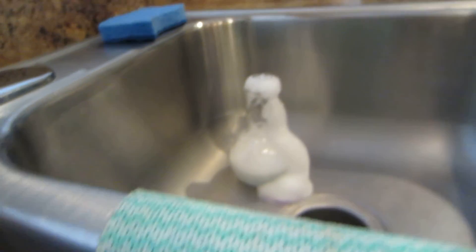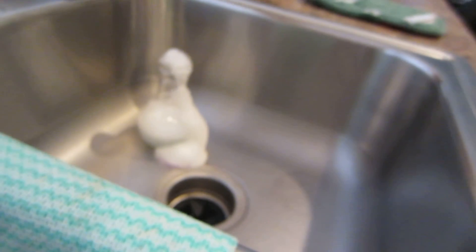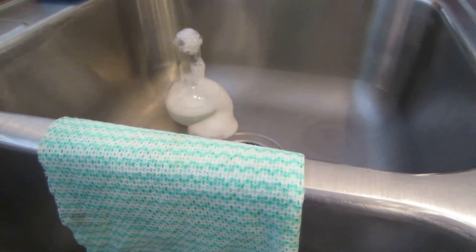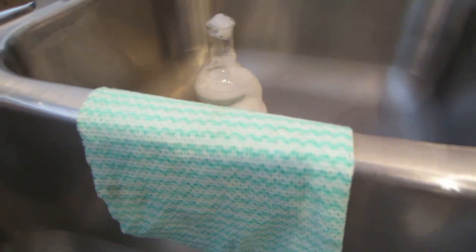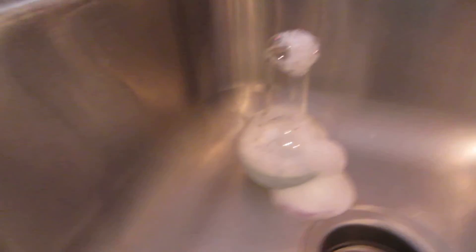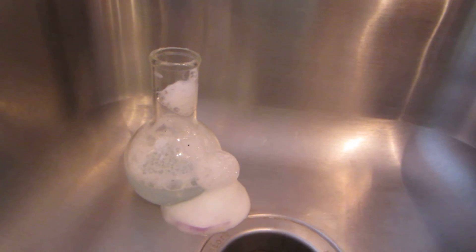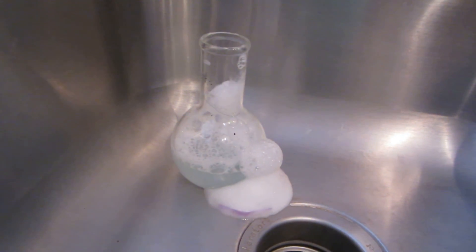What's in there? It was vinegar, baking soda, sodium carbonate and sodium bicarbonate. And the litmus paper. Can you still see it? See it down there?